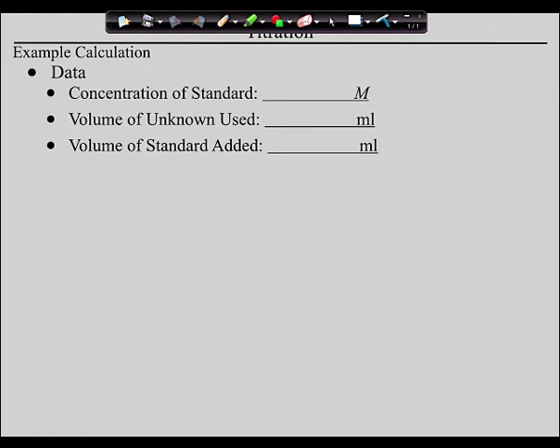Now, the thing that's weird about a burette compared to a graduated cylinder is this. Guys, where's the 0 mark on a graduated cylinder? At the bottom, right? And up here is 50. Well, guys, a burette is actually upside down. 50 is at the bottom and 0 is at the top. Why would that be true?